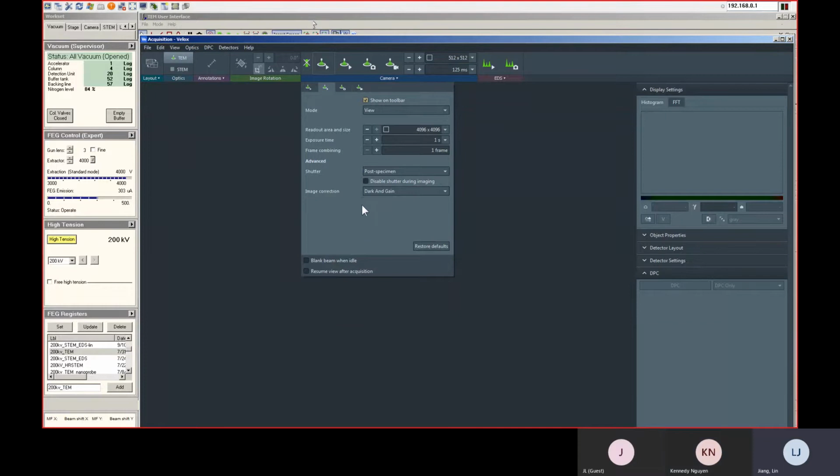So then we can set up, you can change this view to acquire as well. You can do second preview. And also you can do acquire. You can set up acquire here. Like you can set a preview is 1K by 1K, 1 second. You can set the first preview 512 by 512, maybe 0.5 second. This is maybe 0.5 seconds one.